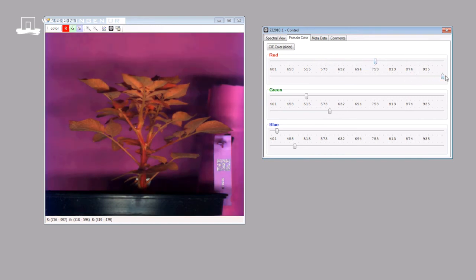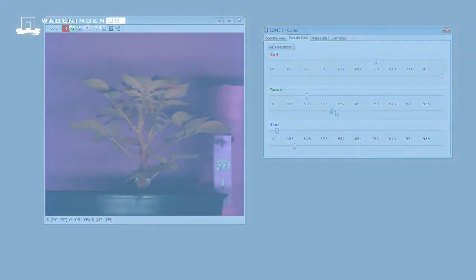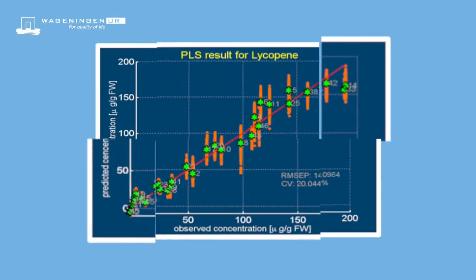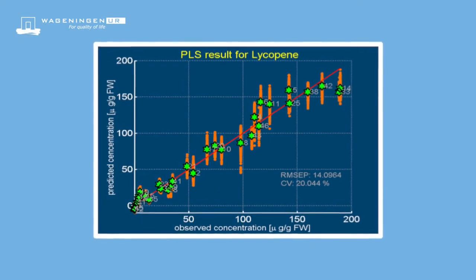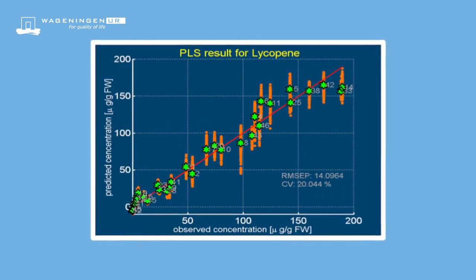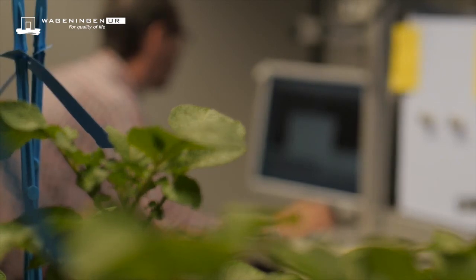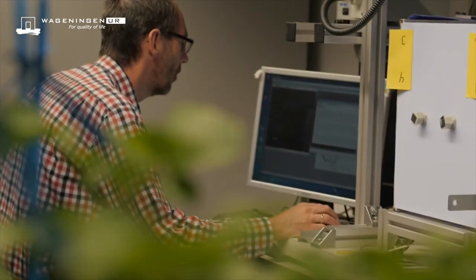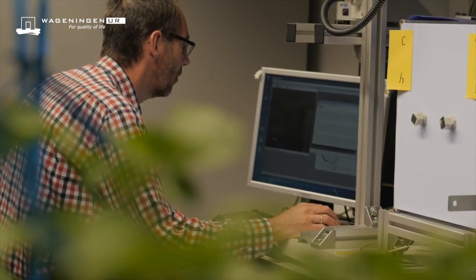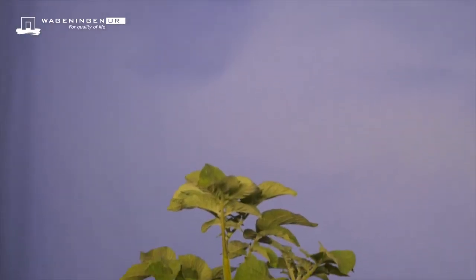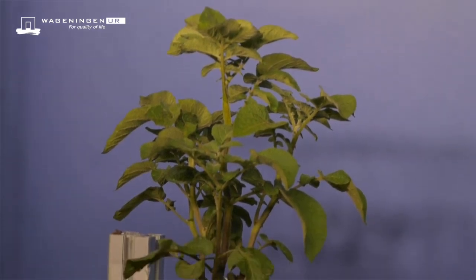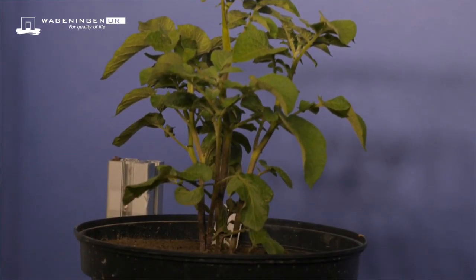The hyperspectral data cube is saved for further processing. Multivariate methods like partial least squares regression are used to build statistical models. Machine learning techniques are used to segment specific parts in the images such as disease spots. Also, commonly used indexes like the chlorophyll index or the NDVI can easily be extracted.